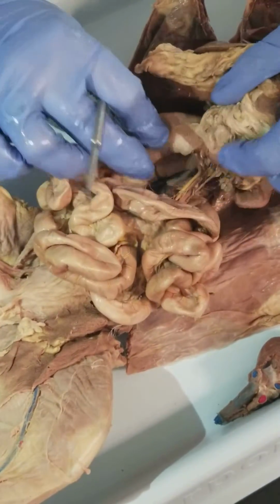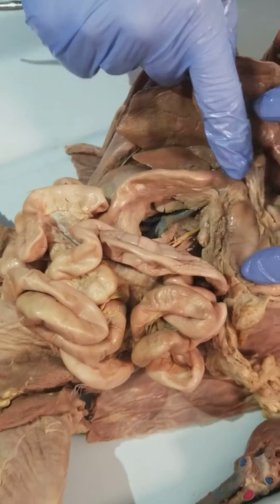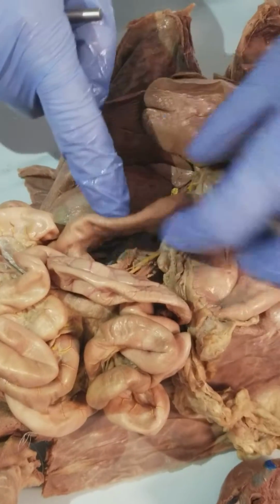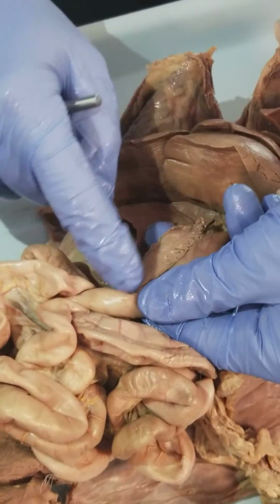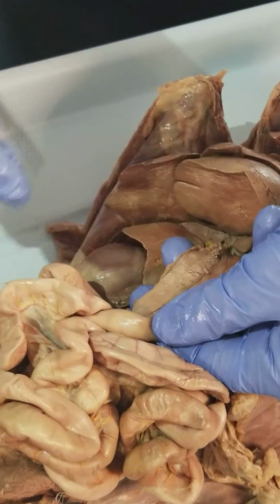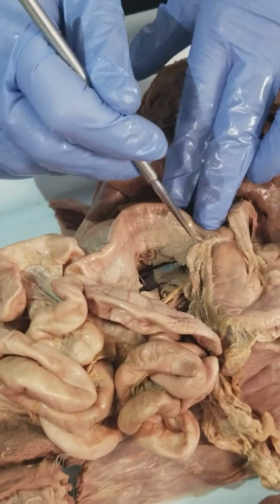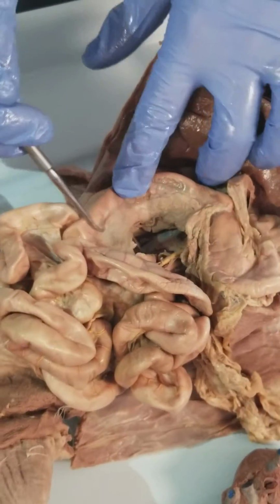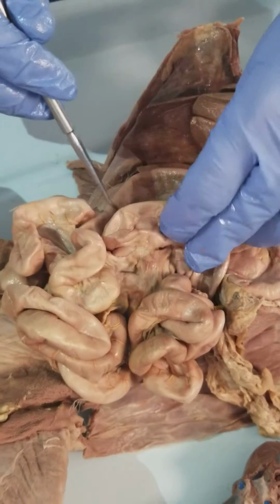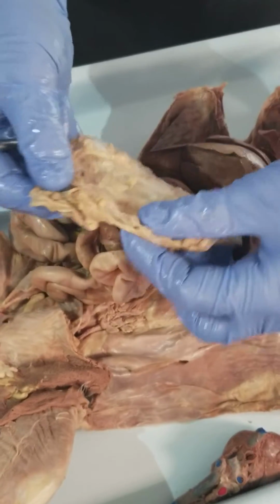Also up in this region, since we're here, you can see there's your pancreas right there. So this is the stomach, the pyloric sphincter, the duodenum, and if you turn the duodenum over, typically you'll see that nice little fish-like pancreas right there, nestled right next to the duodenum. It's basically working with the liver to dump the pancreatic juice into the duodenum to neutralize and start adding digestive enzymes to it.